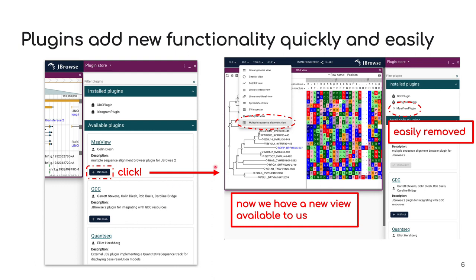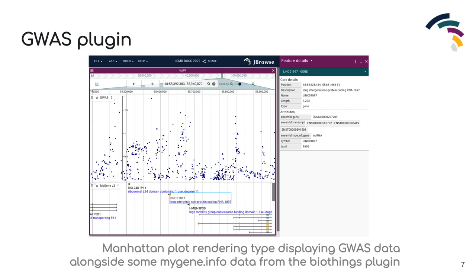Once we click install on the MSA view plugin we're given access to a brand new view that our plugin has made accessible through JBrowse2's menuing. We're easily able to remove it should we wish through this interface on the plugin store. There are currently 10 community plugins registered with the JBrowse2 plugin store, the functionality of which range from new renderer types such as Manhattan plot renderings shown with the genome-wide association studies plugin, to data adapters for genomic data resource APIs such as with the genomic data commons plugin.